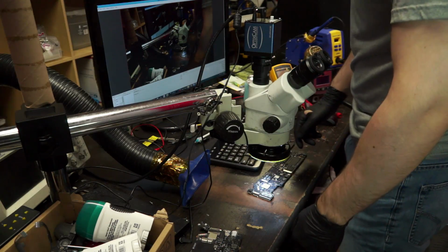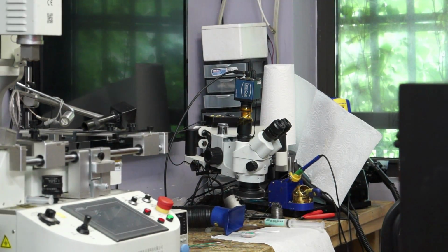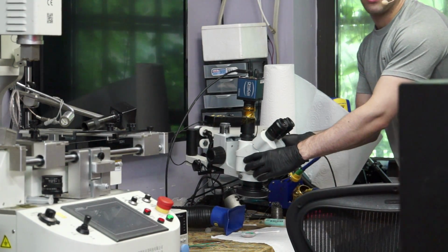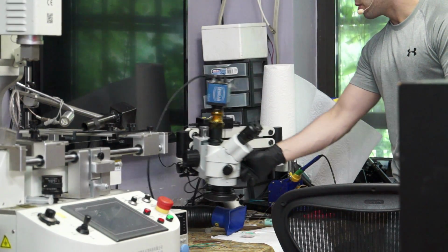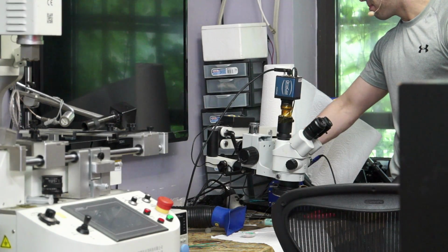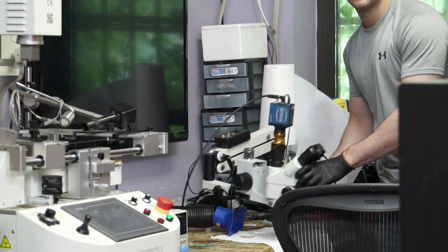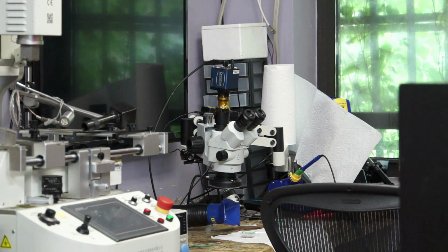Now, compare and contrast this to this thing over here, my other one. This is an articulating boom stand. The idea with the articulating arm is that it moves around. See, if I want to go up, I can do this. There's no screwing it, no loosening this and tightening this and loosening that and tightening this. It just moves around nice and smoothly, which is a nice feature. And of course, the moment that I decide to put the screen down, the phone rings.